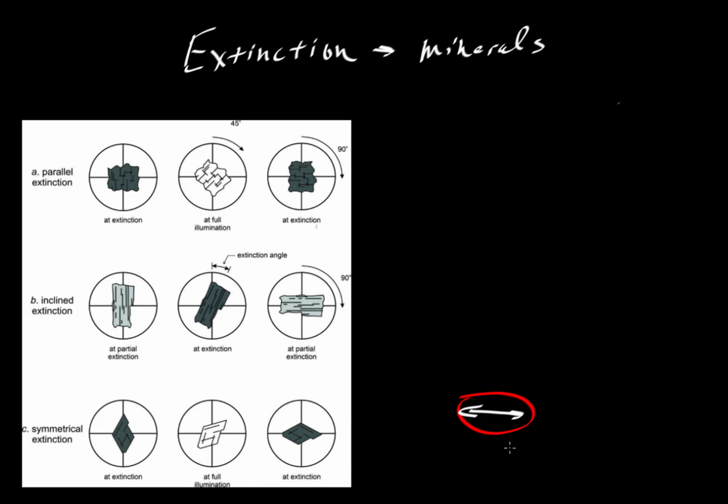As light comes in, it's vibrating in all different directions, but once it comes through, as it propagates up towards the mineral, it's only vibrating east-west. Now let's say this light hits a mineral. So we've got a chunk of mineral here. Once the light hits that mineral, it might have natural vibrational directions that cause the angle to change. So maybe instead of being east-west, it's tilted at some angle. And so now as the light leaves that mineral, it has some angle to it that's not perfectly east-west.